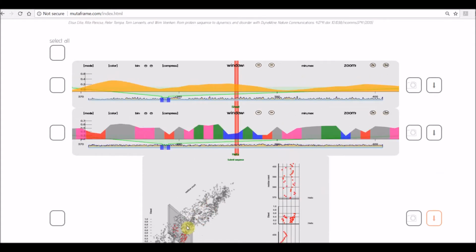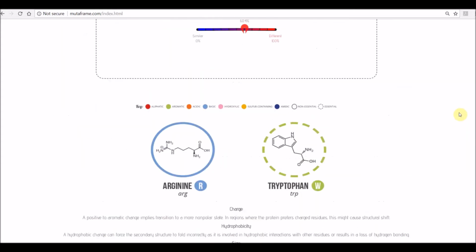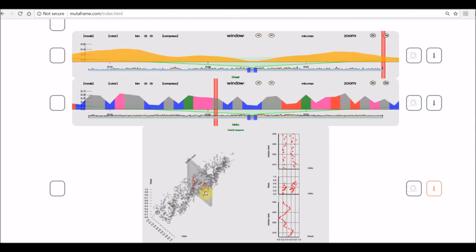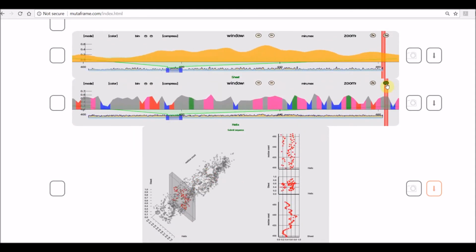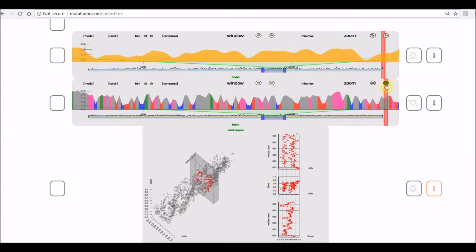So now what we can do is we can synchronize these three of them with each other. The box controls the two, but the other two do not control the box. So now select them, and then we go up, and click on sync selected. And when we go to the bottom, let's move the box. It's normal. Now let's try to zoom out. You see that the box will respond to that. When you zoom in, the box will get thinner. When you zoom out, the box will get thicker.